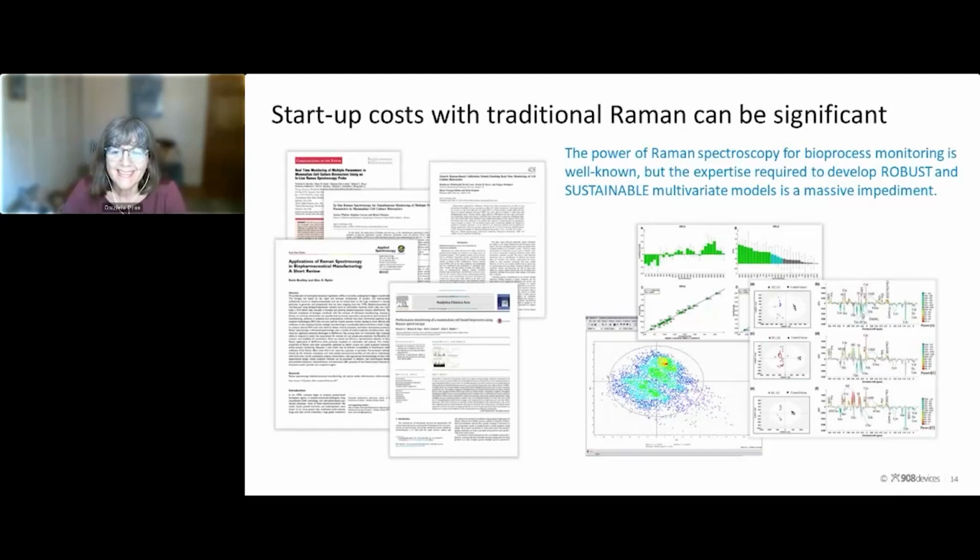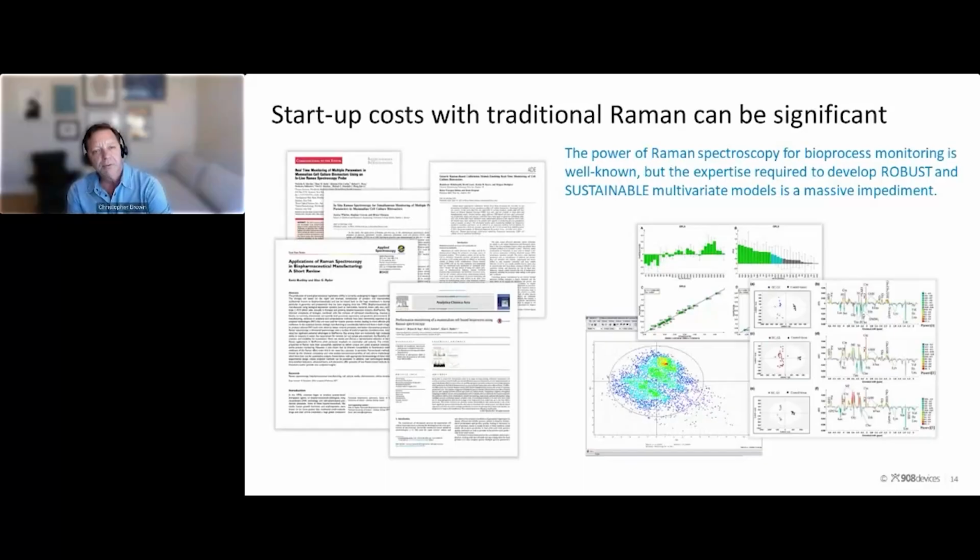Yeah, so very, very powerful analytical technology in Raman, but it can be a significant hurdle to getting everything up and running. So lots of publications over the last 20 years applying Raman in bioprocess characterization, monitoring, but getting multivariate models to cooperate in a very robust way is quite a lift. Certainly doable, but quite a lift.